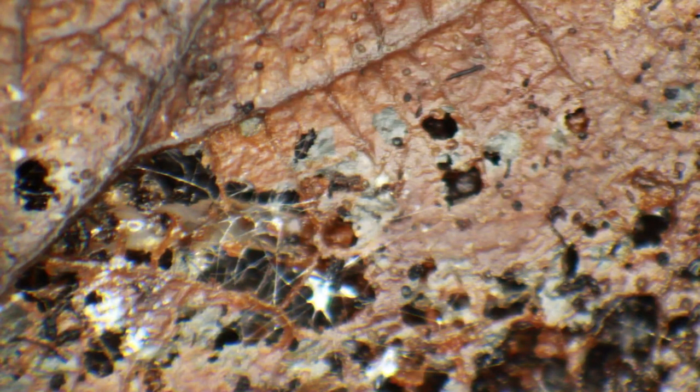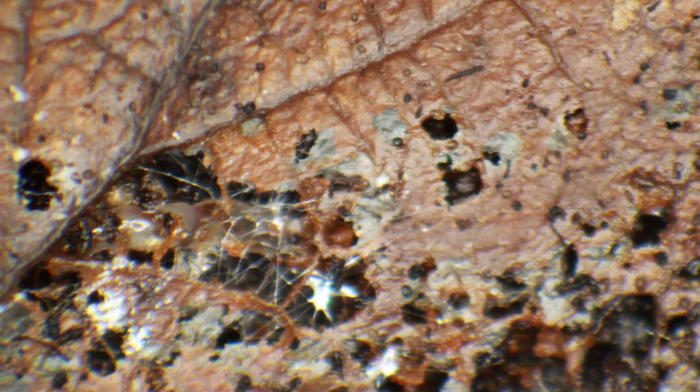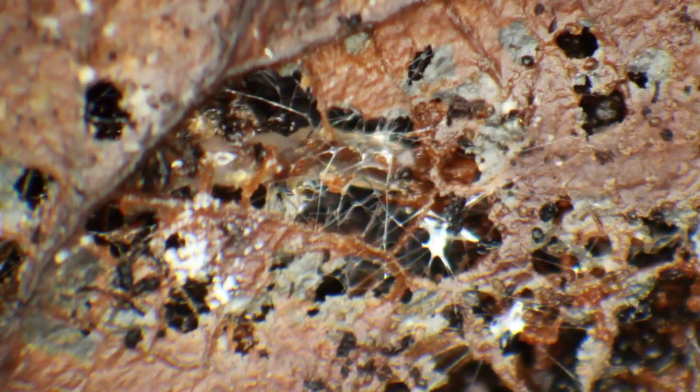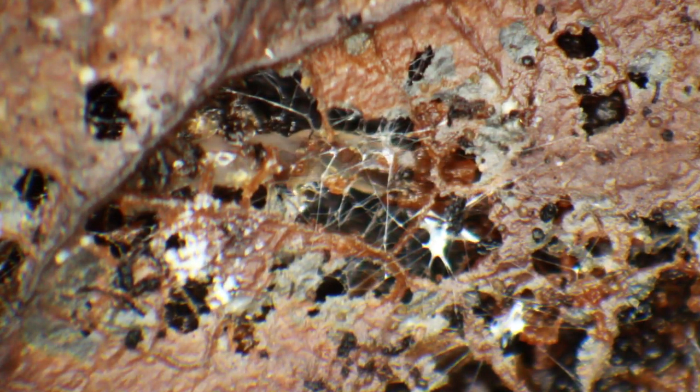I did not expect to see so many animals in this little plastic container after just a few days. That is the whole point — the cycle of life: trees form the leaves and then they have to decompose. There seems to be a larger organism here, possibly a worm or even a larva, because I can actually see some fine white fibers — that seems to be the silk of a larva.